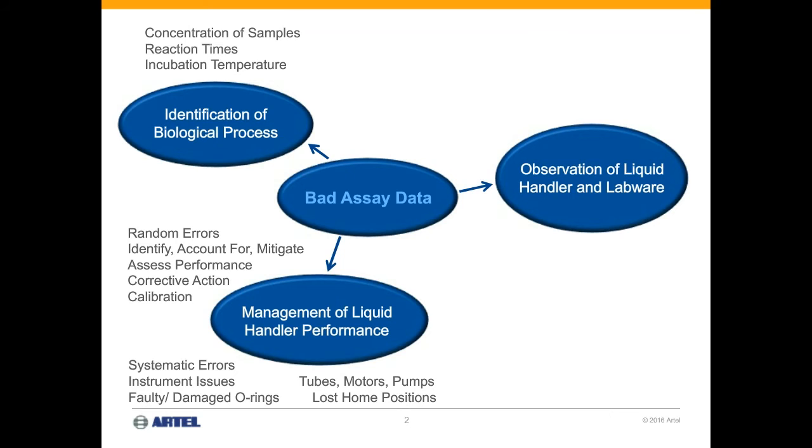I'm not sure what it would be outside of the U.S. You may be using that for a long time and it may work perfectly well, and all of a sudden you're seeing poor results with your assay. What happens with these third-party private-labeled labware is that they OEM that out to a manufacturer. At a certain point in time, they may change the manufacturer, and so all of a sudden the dimensions are slightly different. So be aware of that.